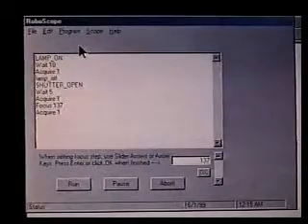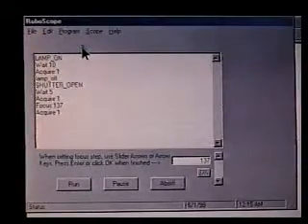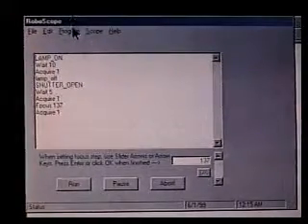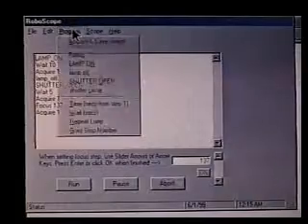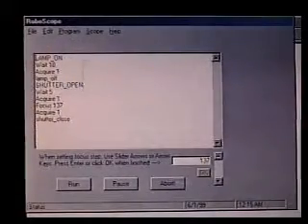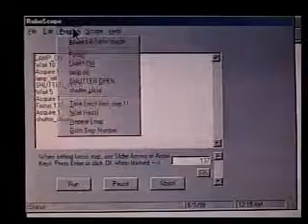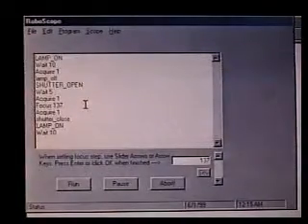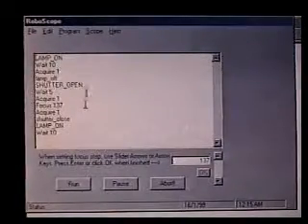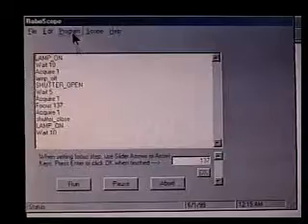Then we'll close the shutter, and turn the lamp on. Wait a little bit for the lamp to stabilize, and acquire another image.